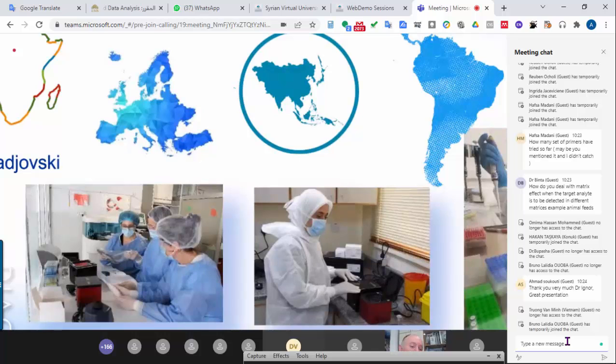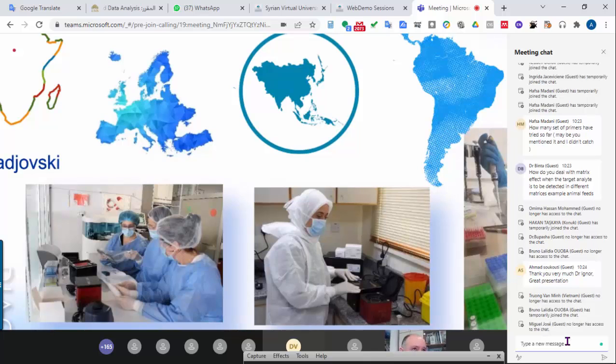But if you have limited resources, either samples or reagents, and you use 10, like I presented, then theoretically you should have 9.5 positive out of 10. In theory, this is impossible, of course. So if you use 10 replicates, then you must have all 10 positive to obtain 95% or a little bit above confidence.